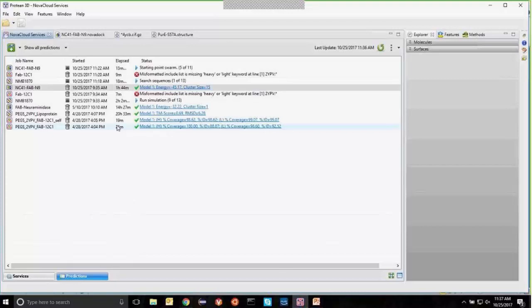So rather than doing a lot of hard simulations, which is where the majority of NovaFold's time is spent, this is more of a quicker homology modeling pipeline in its current form. We're thinking about adding more refinement capabilities if people want a little more refinement effort placed beyond what the energy minimization and some of the rigid body optimizations are doing.